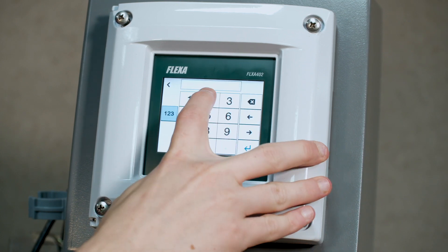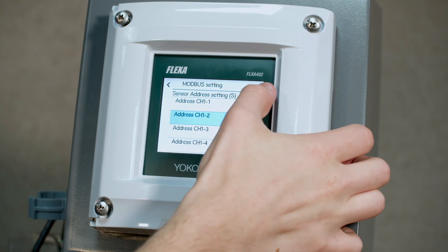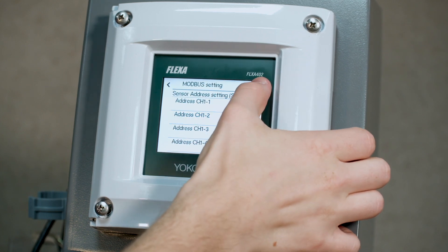You're going to delete 248 and put in the Modbus address of your sensor. In this case it's 2. Then save and go home.